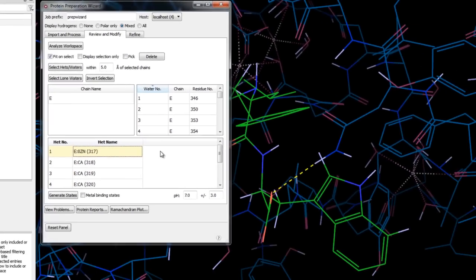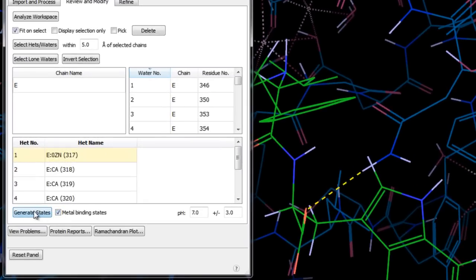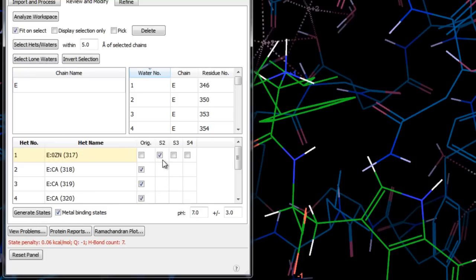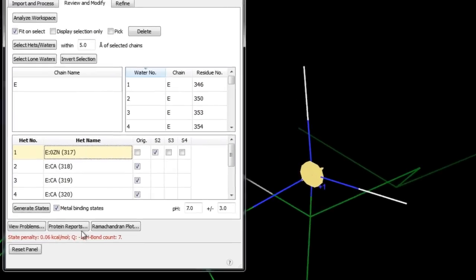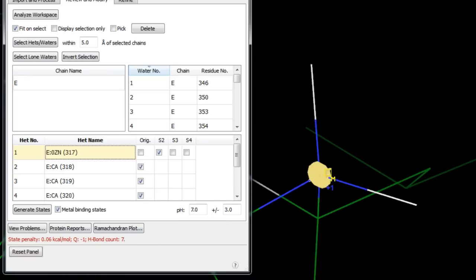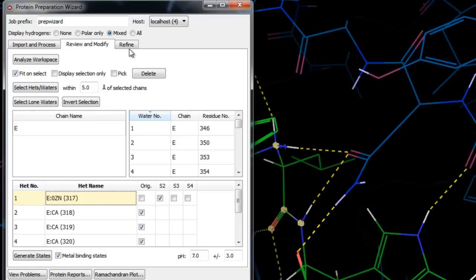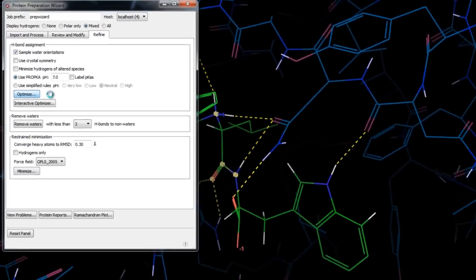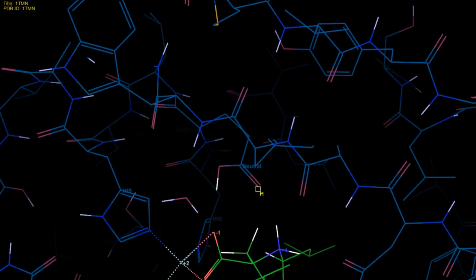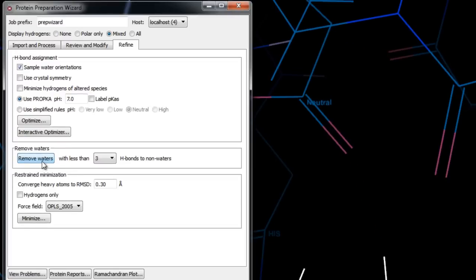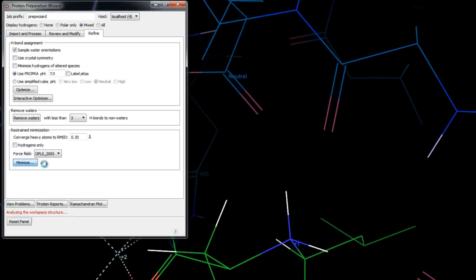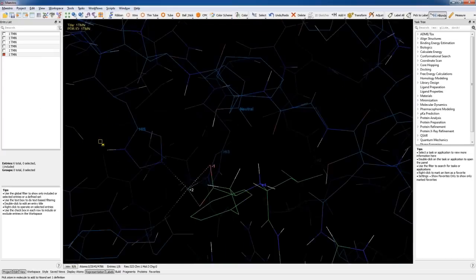We generate states with EPIK this time turning on Metal Binding State, which increases the pH range to generate additional states appropriate for binding to metalloproteins. The best state suggested is state 2, in which the amine is protonated to a charge of +1 — it has the lowest state penalty and makes the most hydrogen bonds to the receptor. In the Refine tab we use default settings to optimize the hydrogen bonding network; a glutamate is now protonated resulting in an additional hydrogen bond with the ligand. We remove non-structural waters, then click Minimize for a restrained minimization to remove atom clashes. The protein is fully prepared and ready for modeling.